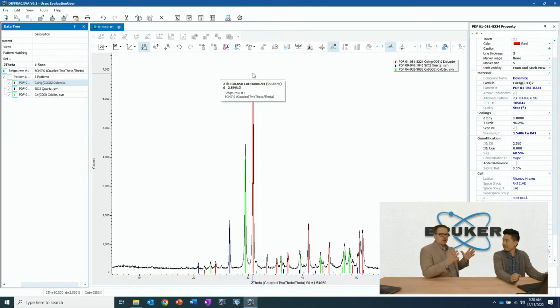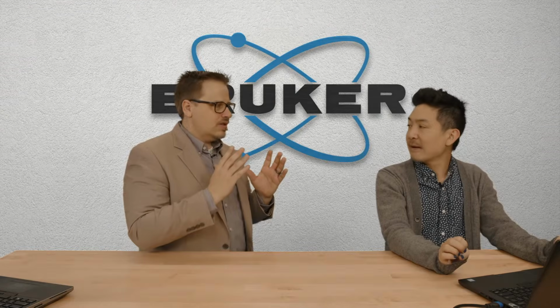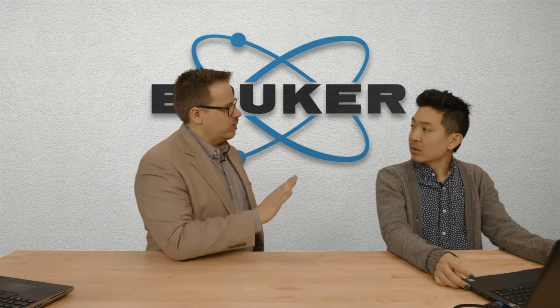Okay. And so the important thing to note here is that when we talk about semi-quant, it's going to be based on this relative scaling. It's not like Rietveld, right, where we're doing the whole fit. Peak intensity. Just peak intensity. It's based on peak intensities. So it's a good guide. Yeah. If you really want the exact number, though, you're going to go to Rietveld next, right? Yeah. But this is a good guide. This is a good way to start out, especially if you have well-ground powder. Yeah, and I think it's one of those things like, right tool, right job, right? Yeah. And this is called the RIR methodology, so the reference intensity ratio. Okay. So reference versus corundum. Yep.